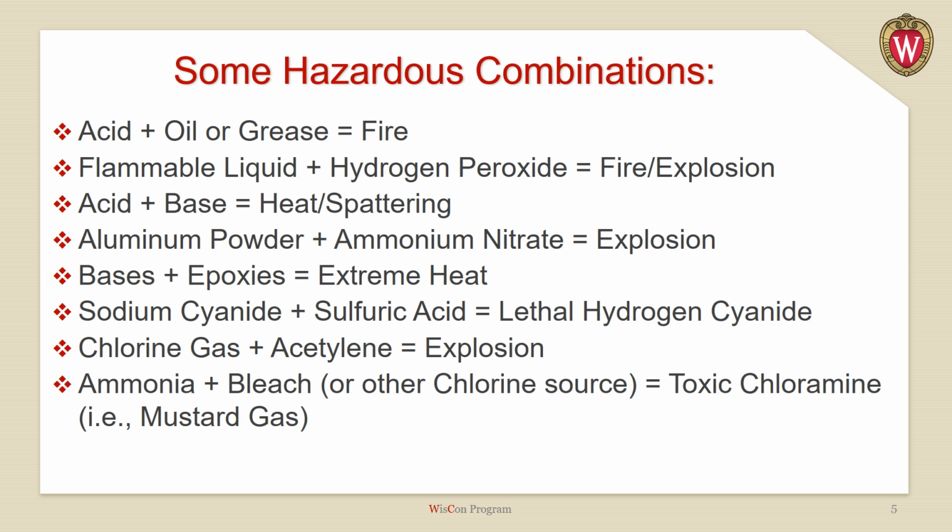Bases and epoxies, you will get extreme heat. Sodium cyanide and sulfuric acid will give you lethal hydrogen cyanide gas. Chlorine gas and acetylene will give you an explosion. Ammonia and bleach or other chlorine sources will give you a toxic chloramine, like mustard gas.